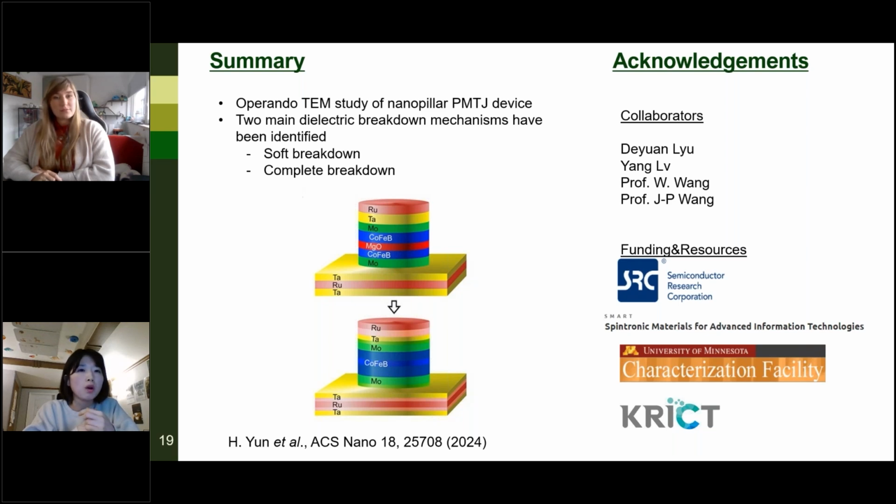I think if I want to be more rigorous, I probably would need to do some multi-slice simulations on these two materials. But I just got the data, and this is not a TEM-oriented paper, so I skipped that part. If you want to be more detailed, then I think it's a good idea to do some multi-slice simulations. Yeah, I understand that.